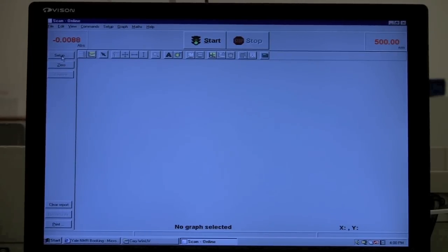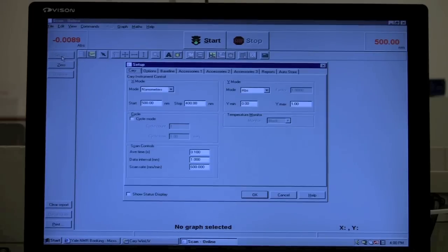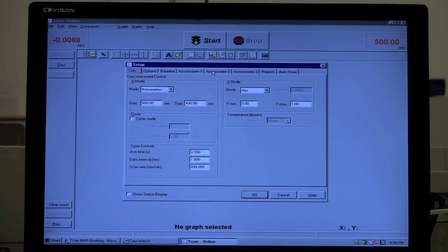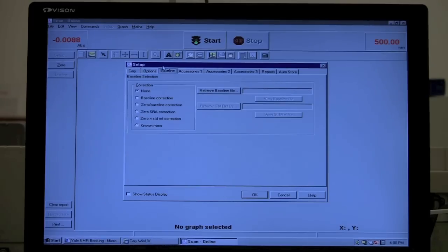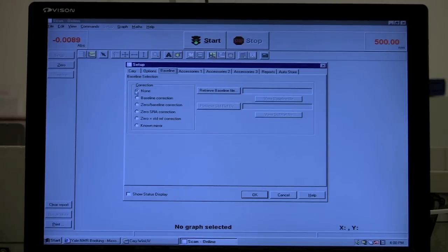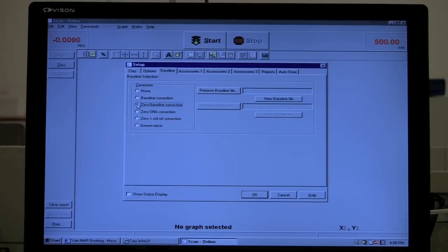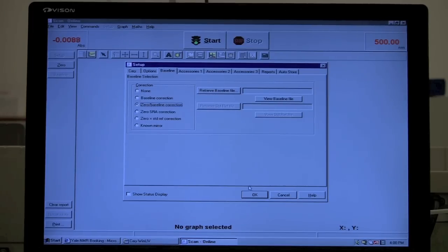So if we go to Setup, if you have some of these sampling accessories in, there may be options under Accessories here. If you want to do Baseline, go to Baseline and indicate what you want to do. So let's do, for example, zero slash baseline correction. So we'll click OK.